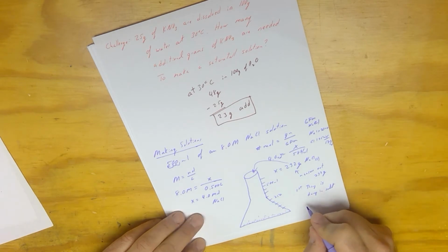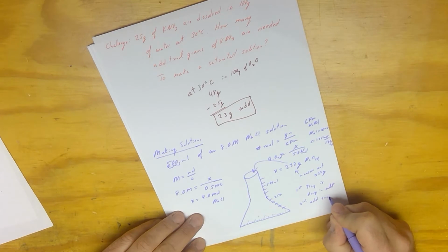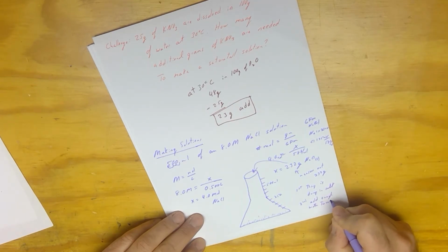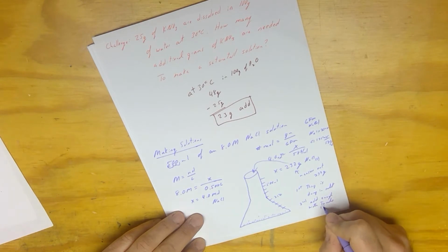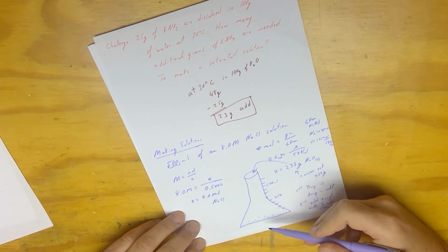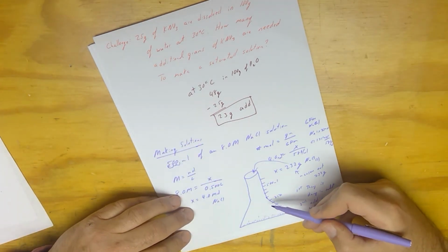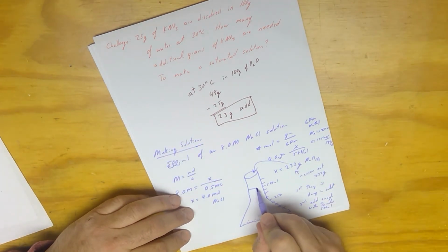Then the second thing we do is add enough water to make 500 milliliters. So we slowly add water, and you've got to be mixing it as you're doing it until we get to 500.